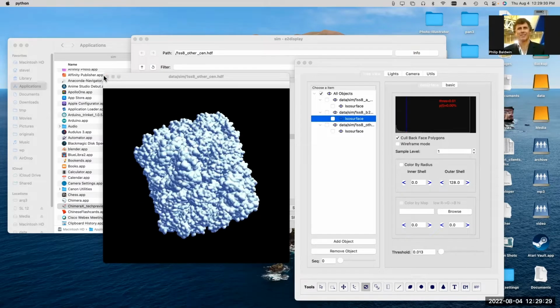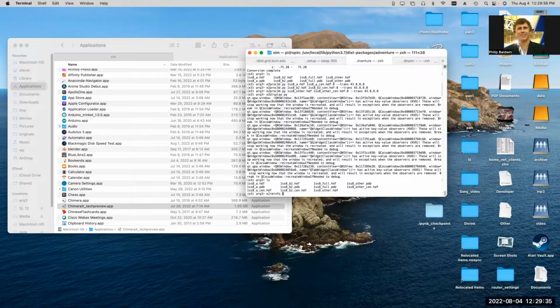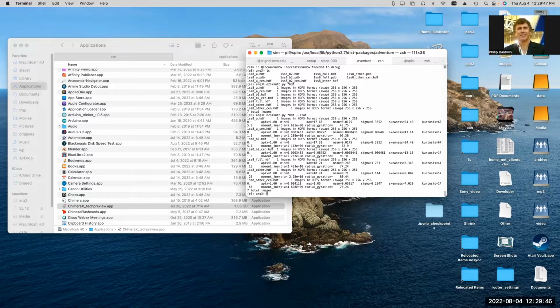All right, let me just take a look and see what happened there. See, sigma 0.3, 0.006. Oh, it was fine before I adjusted the center.